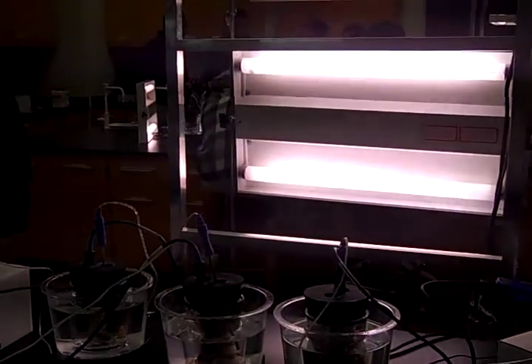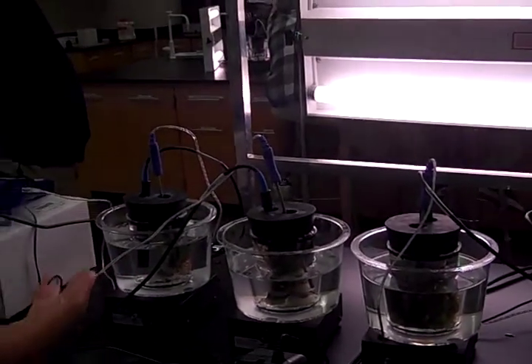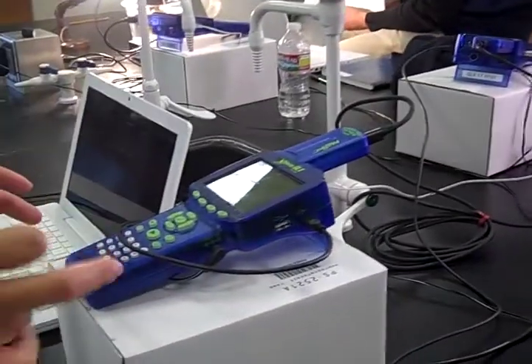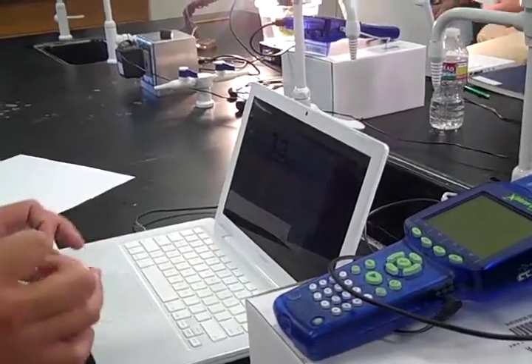We use the light to give the plants in the photosynthesis tank the opportunity to go through photosynthesis. Then the sensors in the tank come back to the GLX, and the GLX puts the data onto the computer where we can look at it and interpret the data.